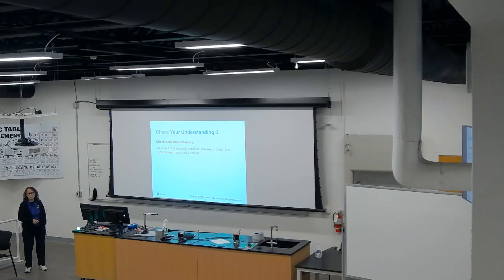So bright field and dark field, do you remember that both of them use wavelengths of light? Similar for phase contrast. So these three are similar. This one depends on the microscope. Sometimes you can use UV light, but definitely these ones are not electron microscopy.